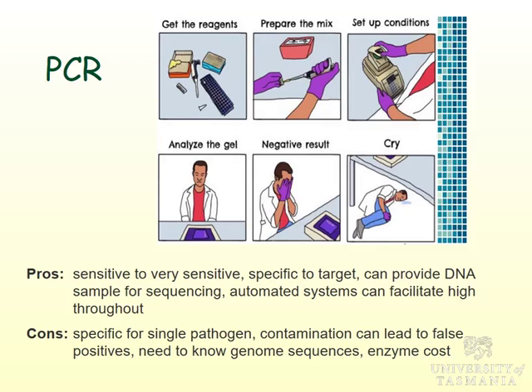That cucumber mosaic virus in lupin seed is a real problem. It's in lupin crops, a real problem. So they want to make sure the seed is free of the virus. So they actually do both ELISA testing but also PCR, where they grind up 1,000 seeds, run it through a single PCR, and if it's negative, then they go, okay, we certify your seed because less than 1 in 1,000 positives. So quite sensitive and quite useful.